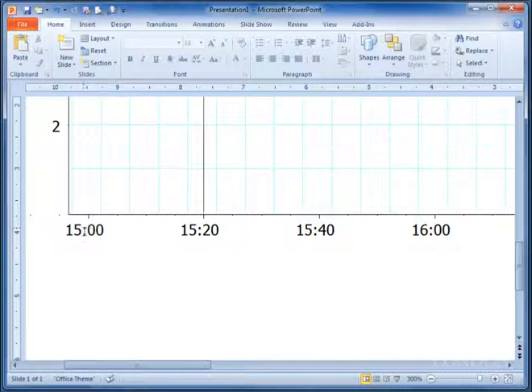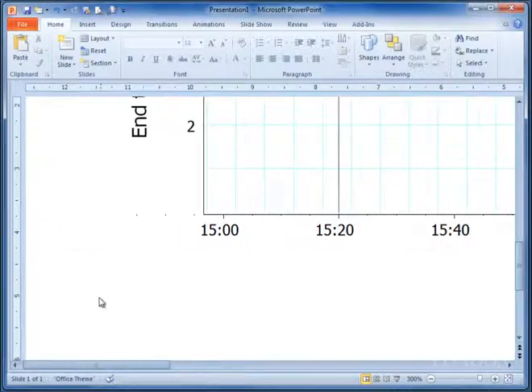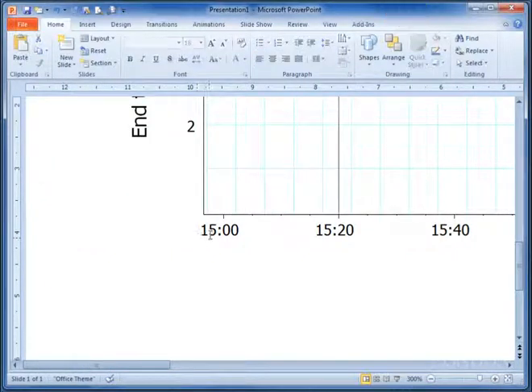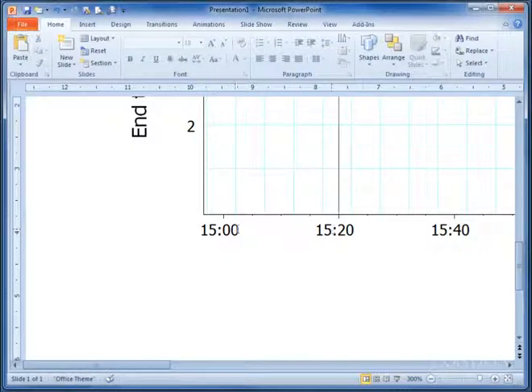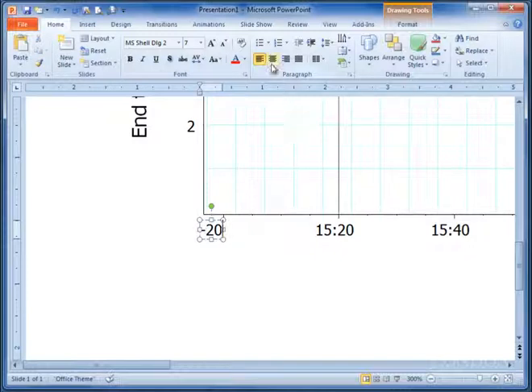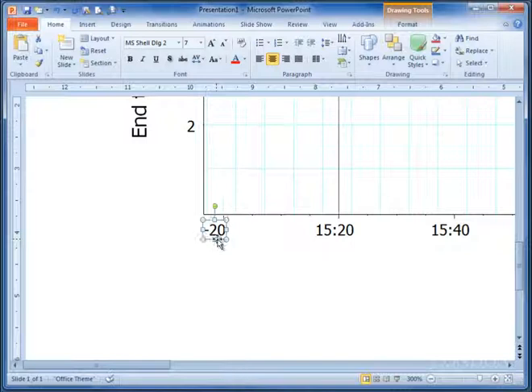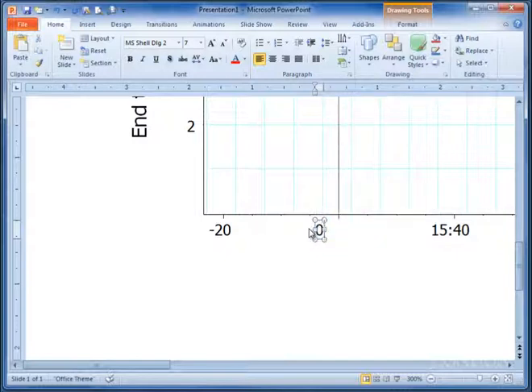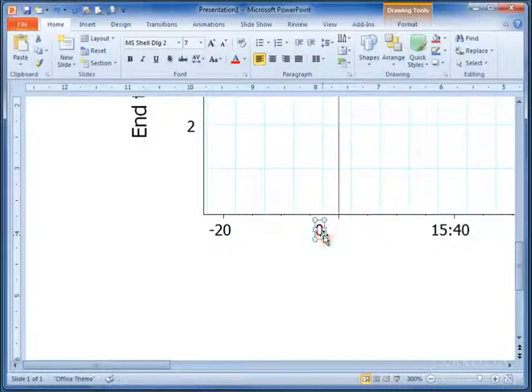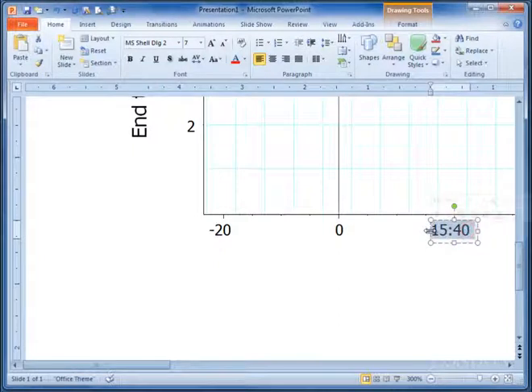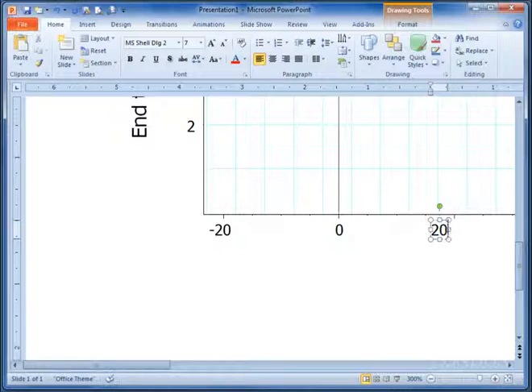This is now minus 20. Yeah, it's 20 seconds before the start. So we can center that and put minus 20 next to that little one there. This is going to be zero. And again, we can center that over the line where we've decided it's going to be. There we are. This is going to be 20, so we can select and replace that with 20. And I'll do all the rest and come back when I finish.